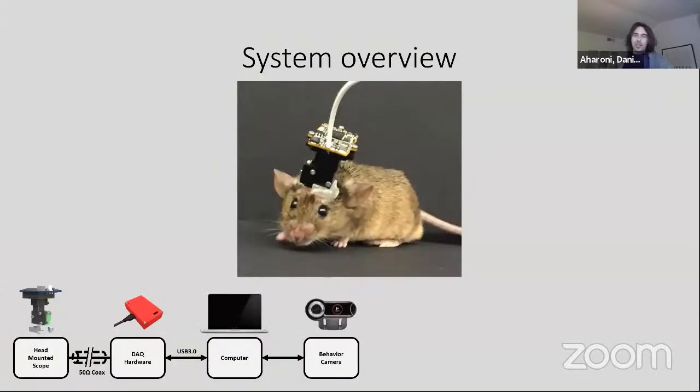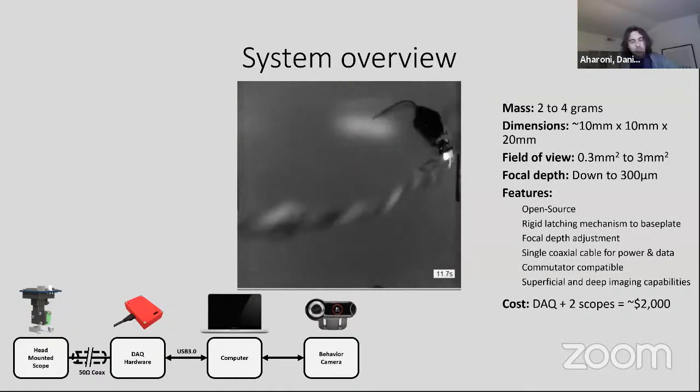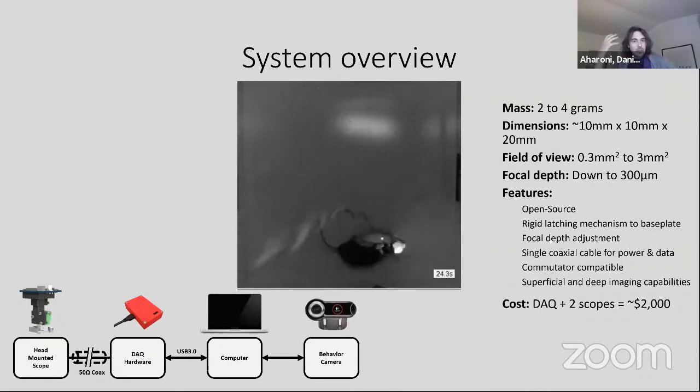Okay, so what does the system look like? This is the original miniature microscope we developed that we openly shared, which we call a version 3 Miniscope on a mouse. It was around 3.3 grams. And it allows the mouse to freely behave in this open field while we are imaging neural activity. So the microscope, we'll see in a second, but just shines blue excitation light that illuminates all the tissue underneath the optical implant or cranial window.